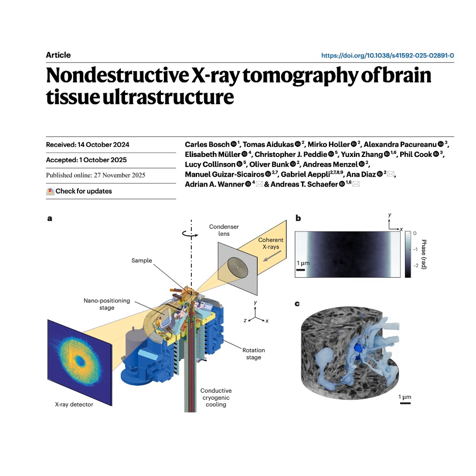Disaster? How? Did it just melt? Both. Mass loss, and then complete disintegration. The standard EPON resin just could not absorb that energy and hold its shape. So there was a known limit. A hard limit, around 6 times 10 to the 8th gray of radiation dose.